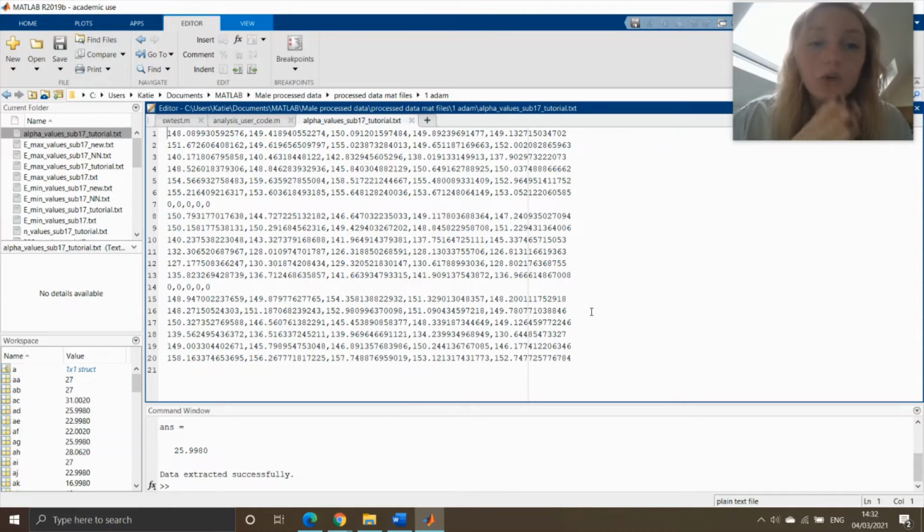And you'll notice that all of the columns here are the different time points throughout occlusion. So my first column there, that's at 5 seconds past the start of occlusion. I said my occlusion delay is 5 seconds into the occlusion process. That's the first data I extract. And then I wanted to do that every 5 seconds past the start of occlusion. So I've got 5 seconds past the start, 10 seconds, 15, 20, 25 seconds.